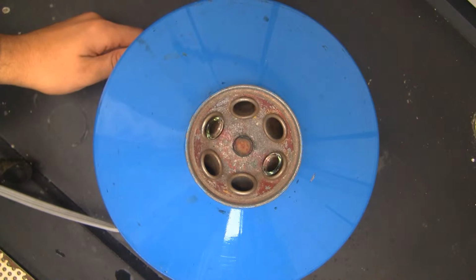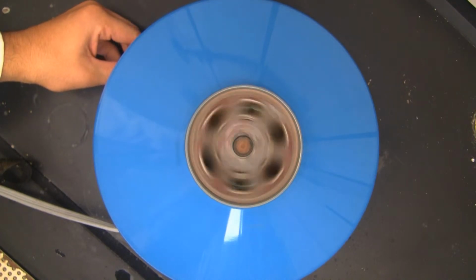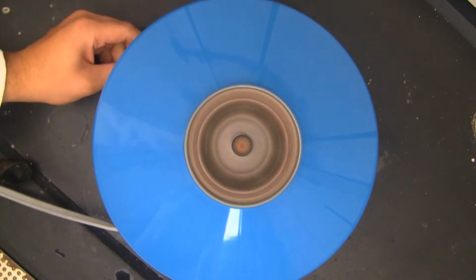The key to properly loading your centrifuge is to have it balanced. Be sure to load your tubes in pairs where each tube has a partner directly across from each other with approximately the same volume of solution in it. Once you have the centrifuge loaded, go ahead and start it up. The length of time and the speed that you run the centrifuge will depend upon the mixture being separated. You will get a feel for this as you progress in the lab.